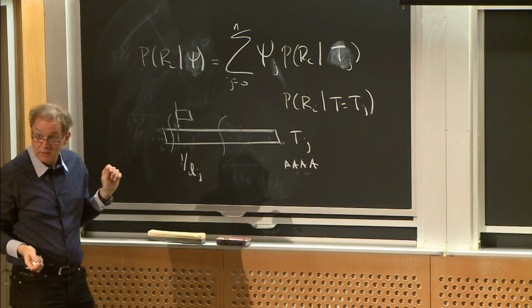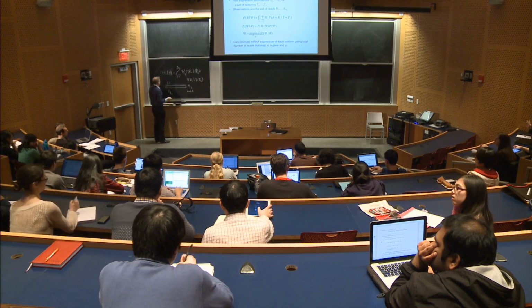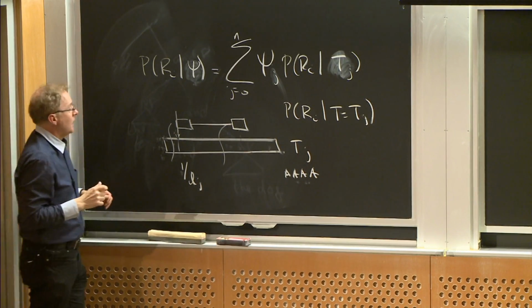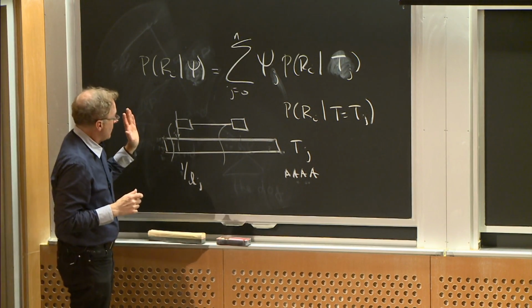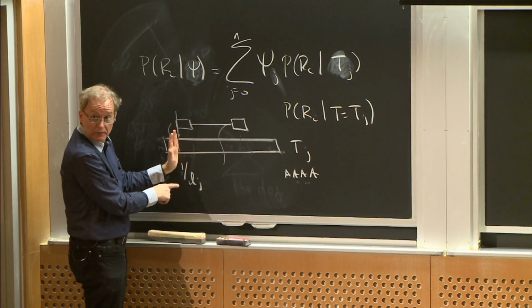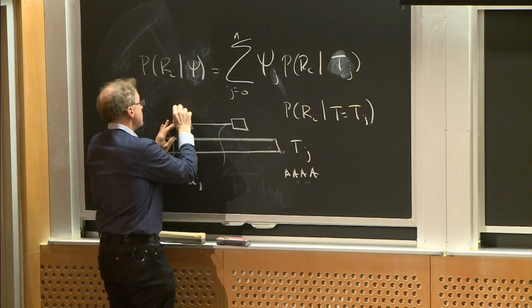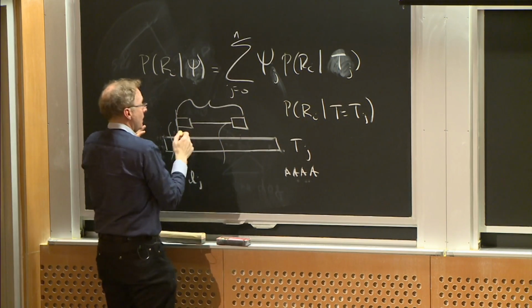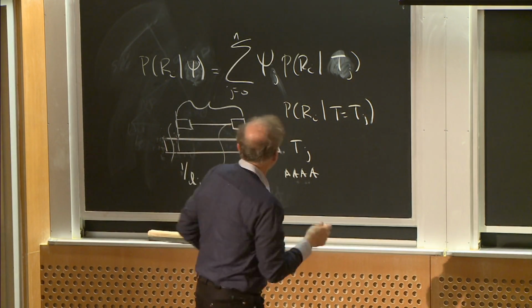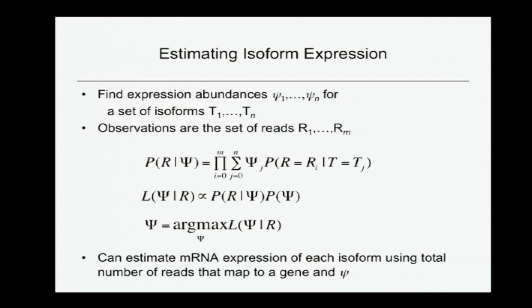Yes. So I do have one more. Can you show us how it extends then to the paired-end read and where the probability distribution comes in? Right. So if we go to paired-end reads, like this, this component is going to be where it aligns, right? And then the probability of the length of this entire molecule is what I had up there before, which is, exactly how did I do that?